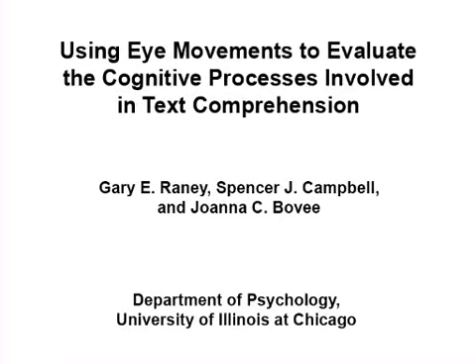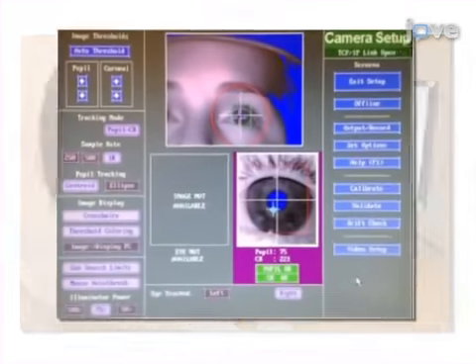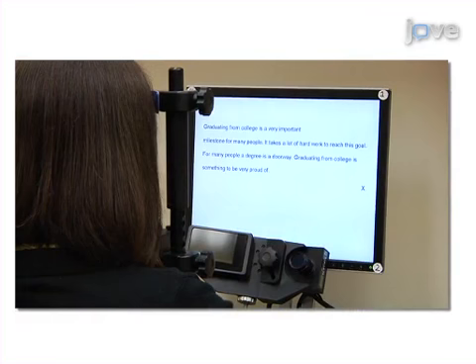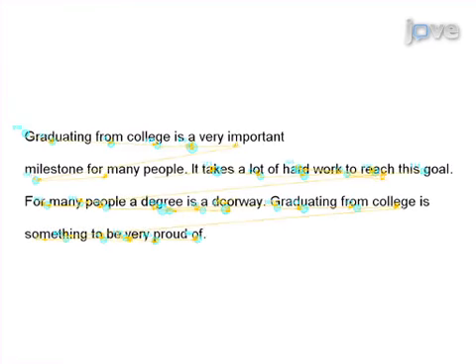The overall goal of this procedure is to record eye movements during reading. This is accomplished by first positioning eye-tracking equipment so that the eye is clearly visible when the subject looks at the display monitor. The second step is to calibrate the software to accurately record movements of the eye. The third step is to display the passages to be read. The final step is to evaluate the duration and pattern of fixations on words in the passages.